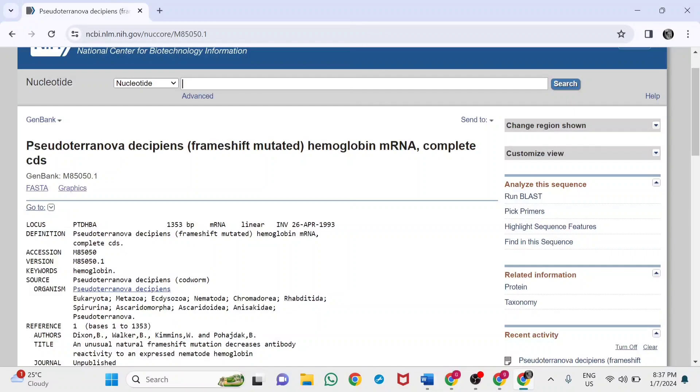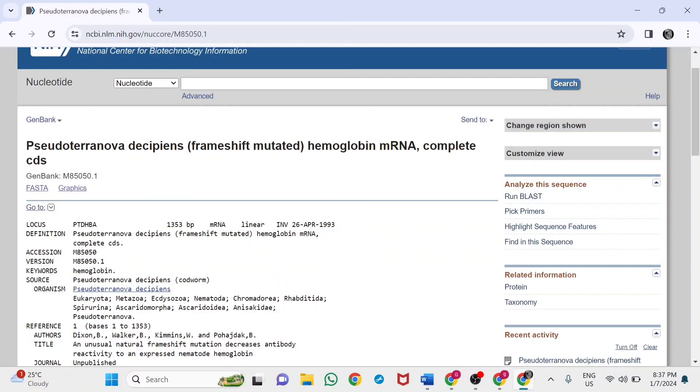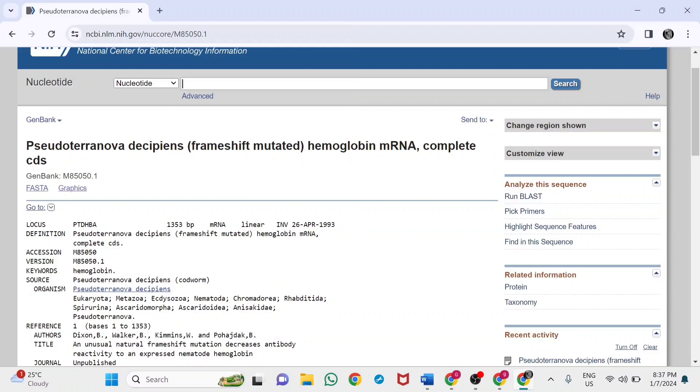Reference materials are available. The locus is like the accession number. In this case, 1353 base pairs on the mRNA linear mRNA. From this, the protein has been sequenced.